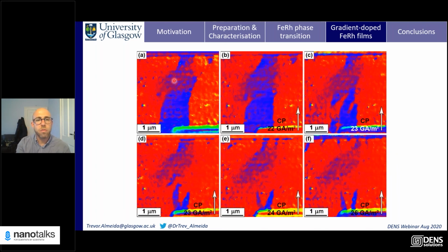So this is a sort of final example where, again, I tried to get parallel domain walls, and we apply increasing levels of current density, and we can see how we've annihilated or sort of broken up this domain wall here. We've got a thin needle to it. We increase the current density until essentially we annihilate the original domain walls, and it looks like we've got some pin domains just at the bottom, which kind of look like horns as well.